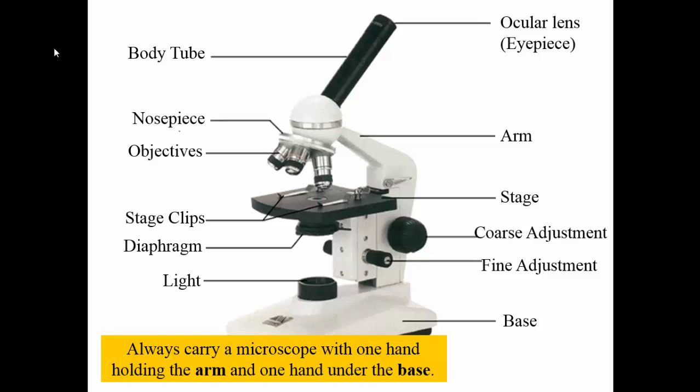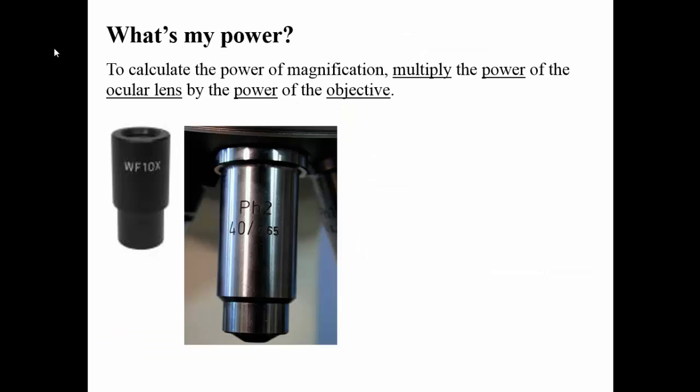It is important to remember that when you carry a microscope, you're going to pick it up by the arm and the base, just to make sure it's a little bit more stable. You don't ever want to pick it up by the eyepiece, because the eyepiece is actually removable. If you pick it up by the eyepiece, the eyepiece will detach from the rest of the microscope, and then the microscope will crash to the ground, and that's never good.